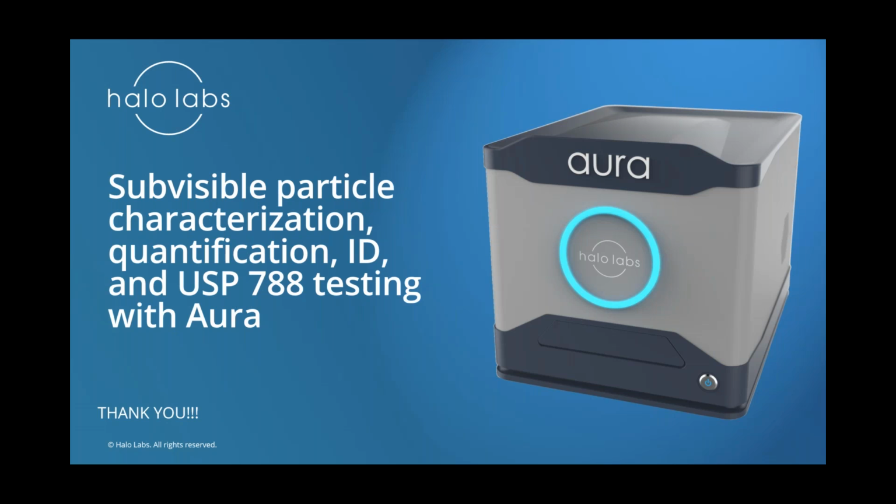Okay, great. And one last question is about dimers and trimers of proteins, and do we measure those? Are they large enough typically to be measured on the Aura? Good question. No, that's more in the SEC domain, where you're looking at less than 10 to 20 nanometers. We're more at 1 micrometer and above, focusing on the subvisible size range for this product line. Okay, great.